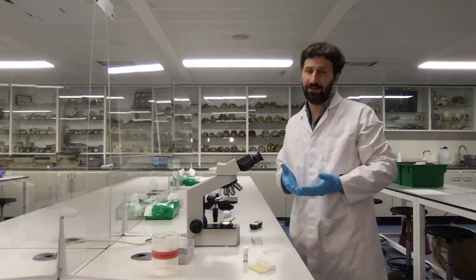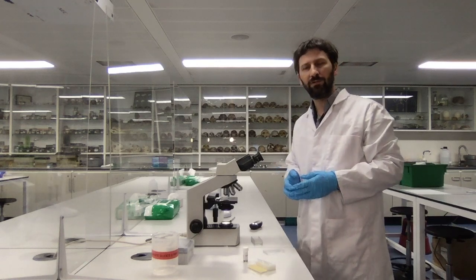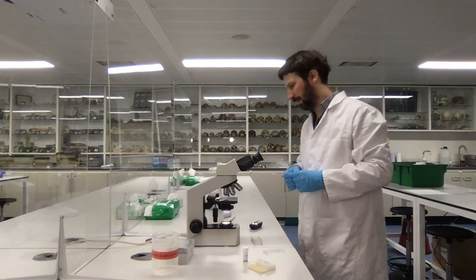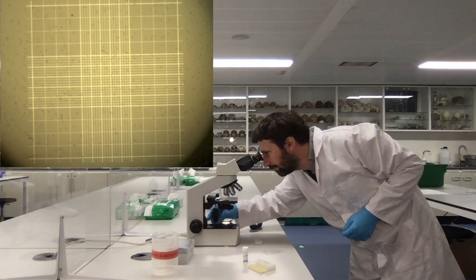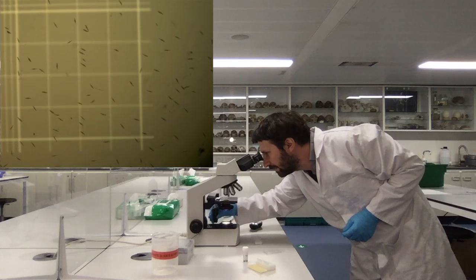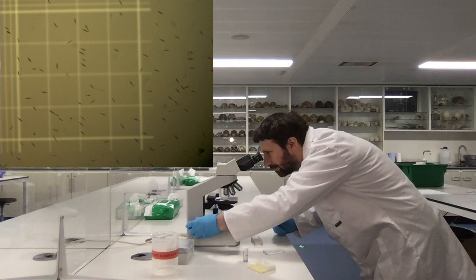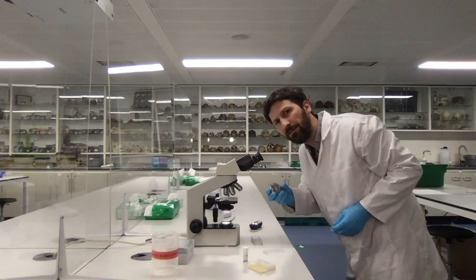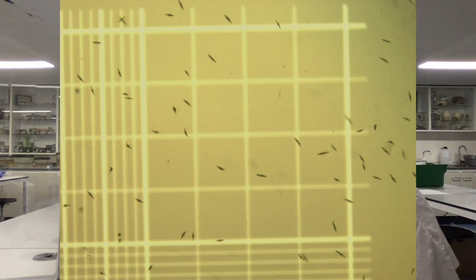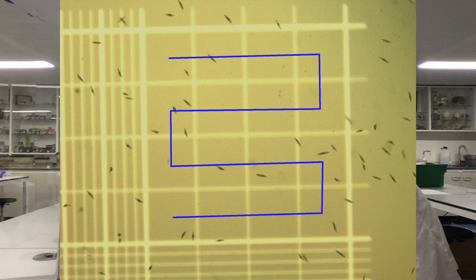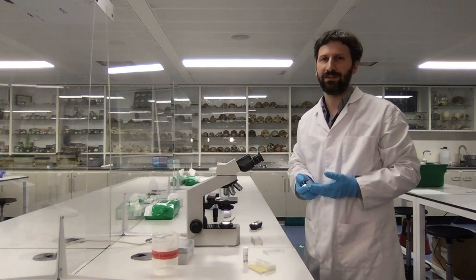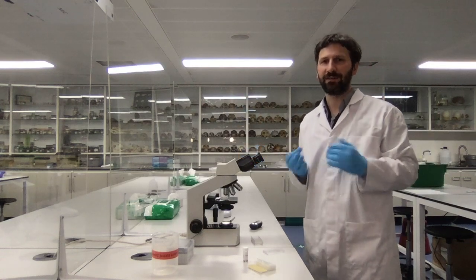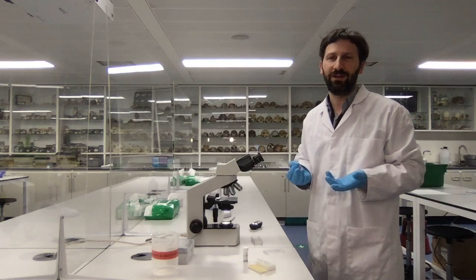Because Euglena is relatively large compared to red blood cells, I'm going to use the four squares on the edges of the grid for counting. I move with the XY knob to one of these squares, but I can see them swimming around, so they are not very easy to count. I count following a snake pattern, which is a good way to proceed. I also need a rule for cells that touch the edge of the square — if I include all those touching the edge, my effective area will be larger; if I exclude them all, it will be smaller.